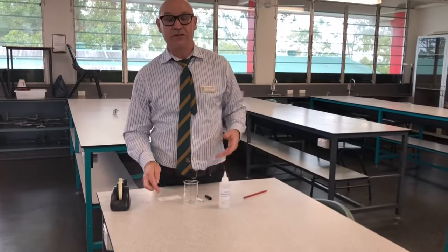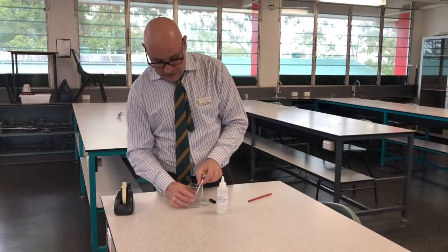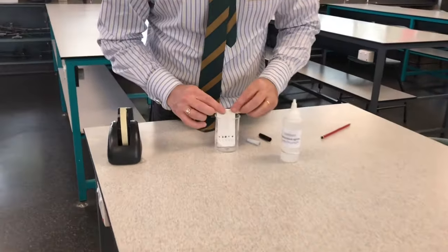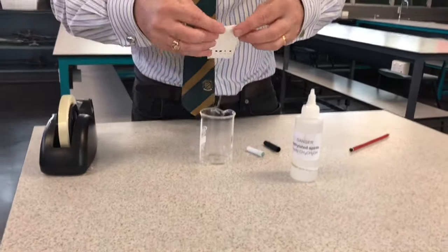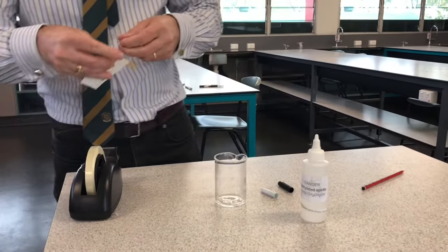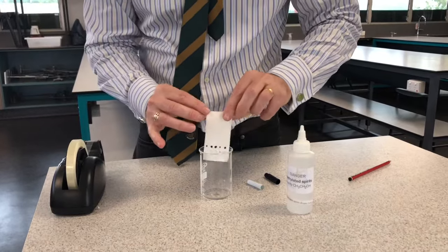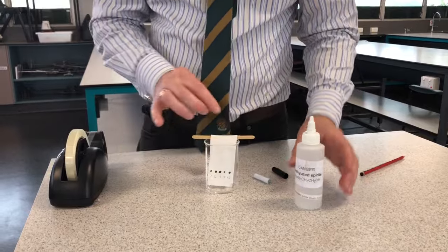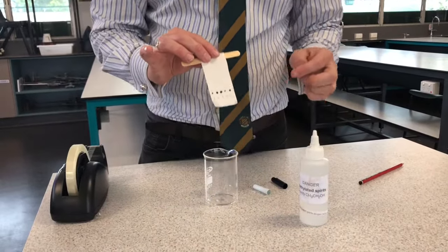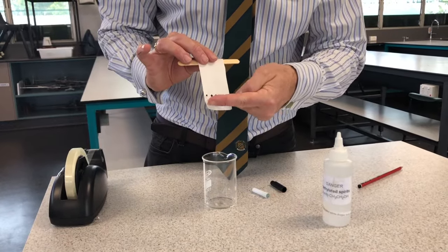We'll use a solvent - a liquid in which stuff dissolves - and we're going to use methylated spirits in a beaker. I'm using a paddle pop stick just to hold the paper so it doesn't fall over in the liquid. The most important part: we don't want to cover the ink dots in the methylated spirits - the liquid level should stop just below them.